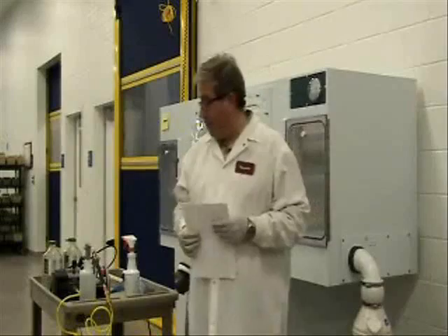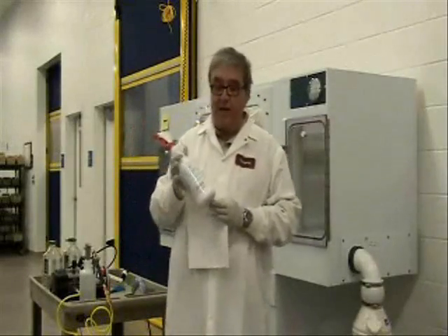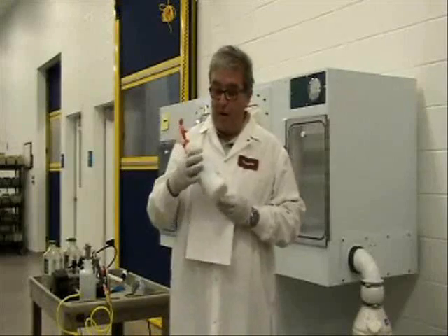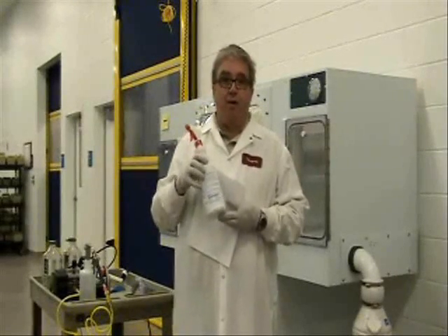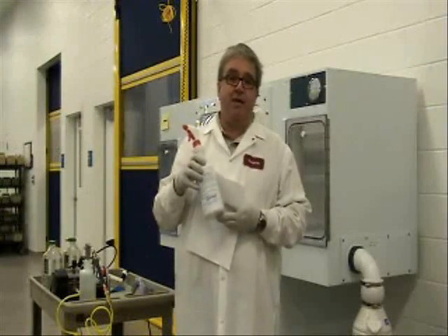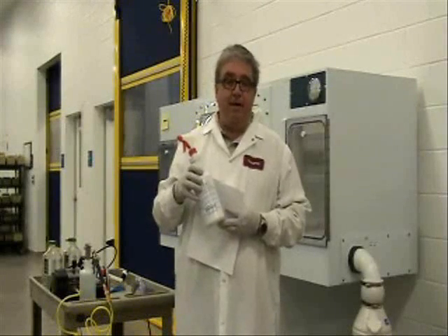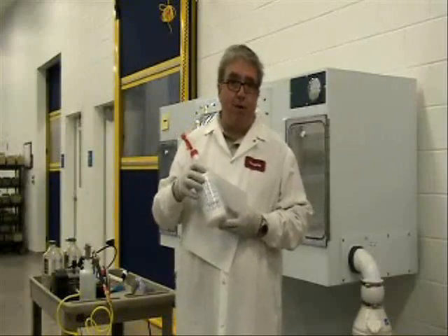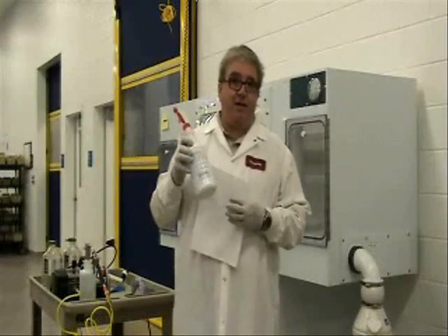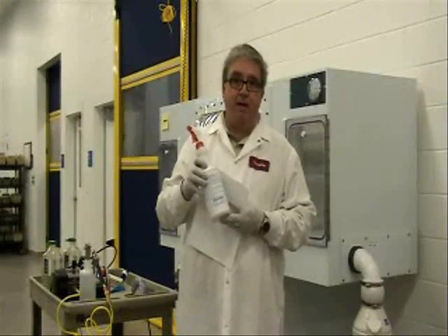We're also going to show you the basic equipment that we have. We're going to show two different methods. One is a hand sprayer where we use something like Clydox or a peracetic acid based sterilant. There are any number of different sterile agents that can be used — Clydox, ABQ, ALSIDE, MD-10, Wilk Lens. A variety of different methods; they'll all be the same as far as what we're going to do in the demonstration.